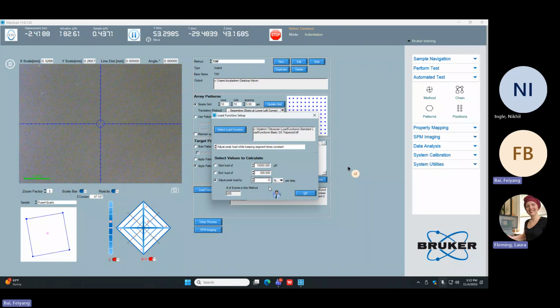We go from high to low with the assumption. Do you understand why it did that? So if you want to choose how to adjust it, then you have to give it one of the other options.